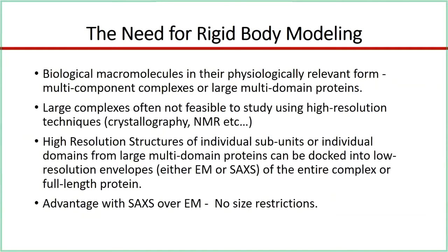The flip side of these assemblies is that they're difficult to study. They're not as easy to study the structures of as the individual components of said complexes, right? There are a variety of reasons for that. Some of them are biochemically extremely challenging. They have low shelf lives and are structurally transient, with potential flexibility, so there is conformational heterogeneity, which Jesse will talk more about in the next talk. And then for one reason or the other, they're very recalcitrant to high-resolution structural determination.